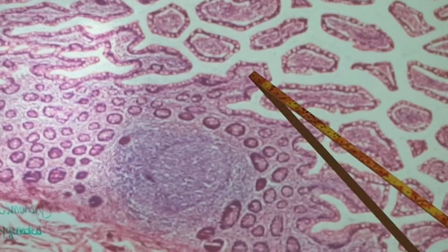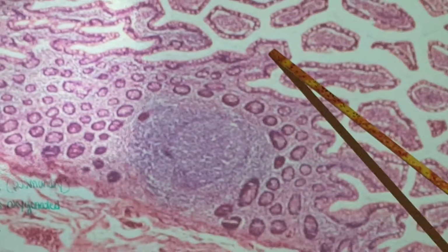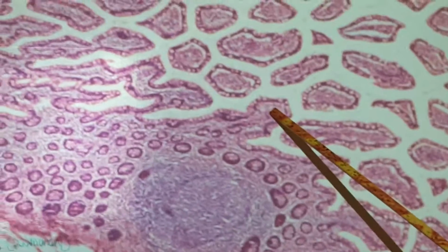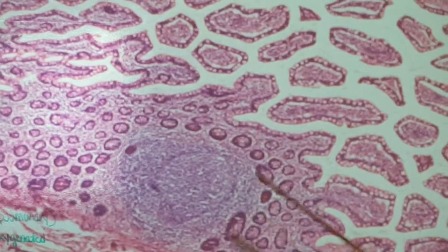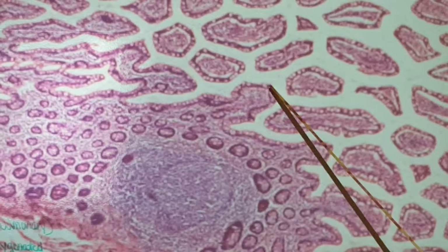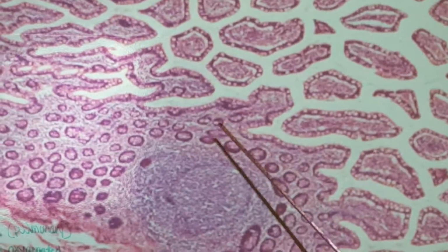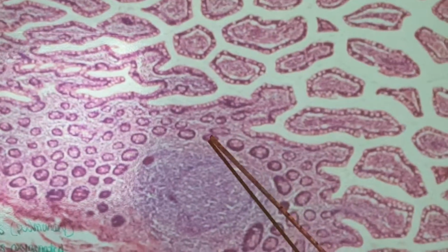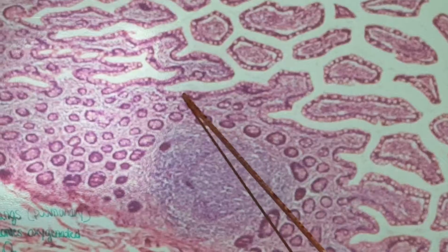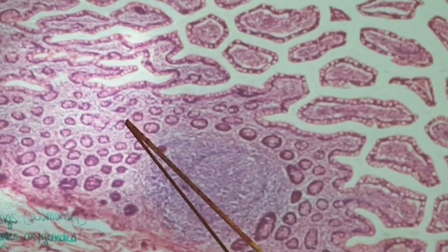If it doesn't have that, then we're looking for lamina propria, because that's what the pointer is actually on. We also have, again, simple columnar, and I'll zoom in on that, but that's the simple columnar around here. These are the intestinal cells, or intestinal glands, in circles. Everything else, again, the background is going to be our lamina propria.